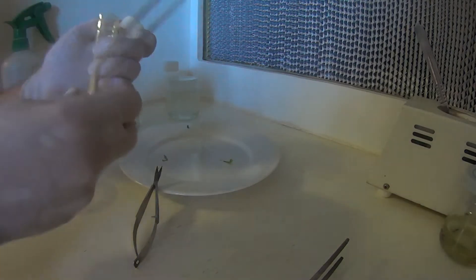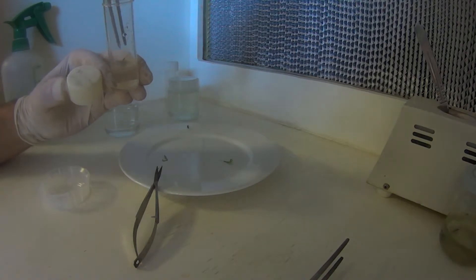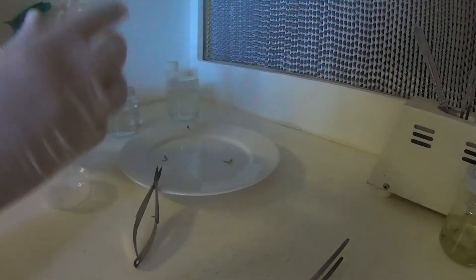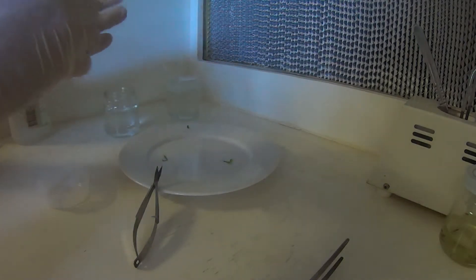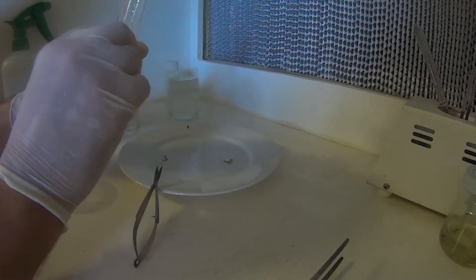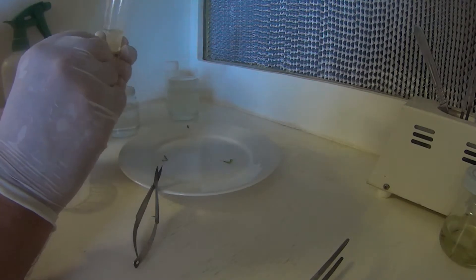Venus flytraps should start to callous up just in plain media. But you can also add some kinitin to the media to help them out a bit. So all I've done is placed him flat down in there. He should start to callous up and grow little Venus flytraps off it in a few weeks. You'll see some little lumps start to appear on it. Hopefully.